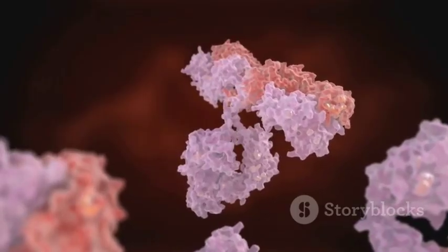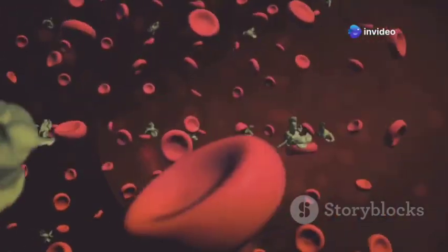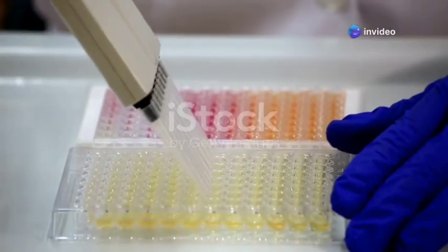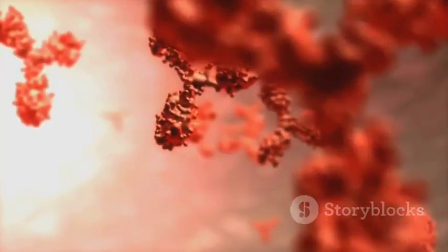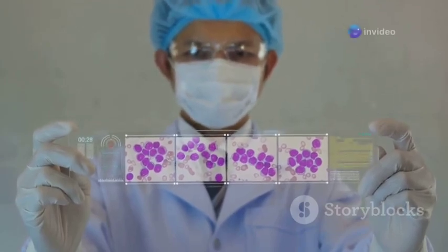Antibodies are like our body's defense system. When a virus or bacteria enters our body, our immune system produces antibodies to fight them off. ELISA uses a special plate coated with antigens. Antigens are like wanted posters for our immune system. They help our body recognize and target specific invaders.